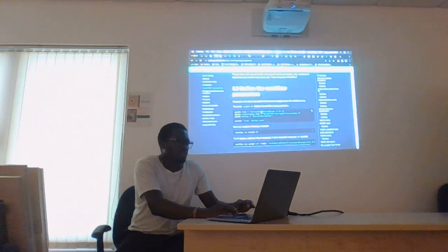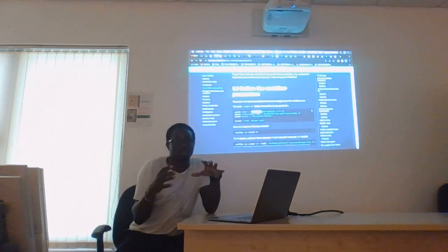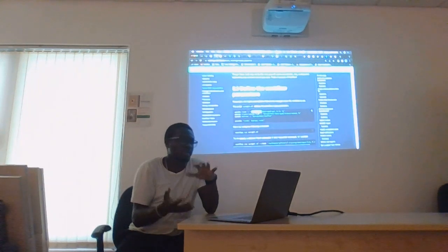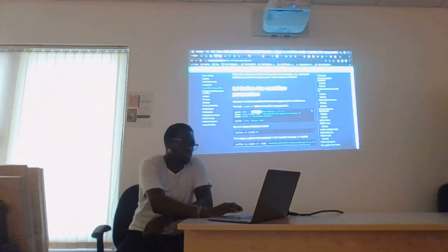Yeah, the other keyword that is in Nextflow is projectDir. This is a keyword that specifies that the workflow is running in your current directory. So you can specify the name of that directory using projectDir.